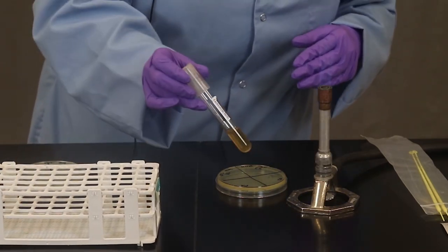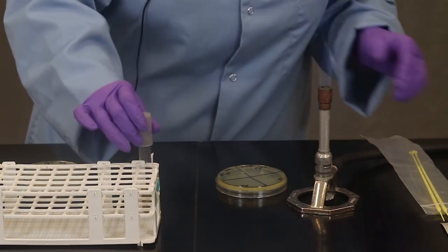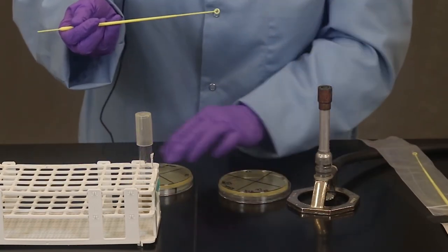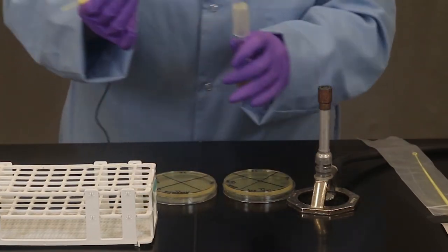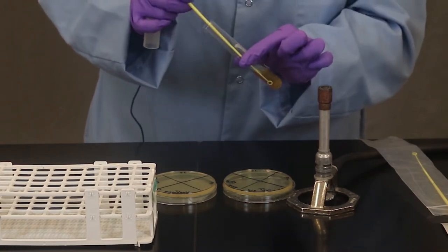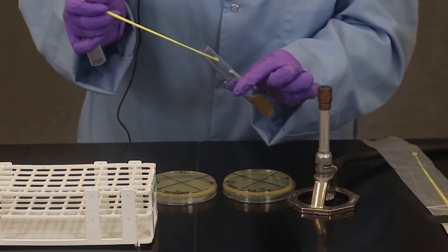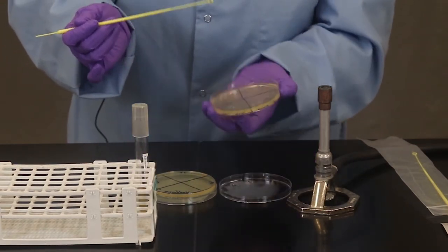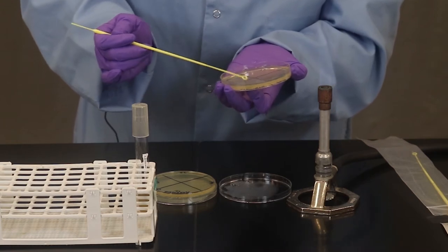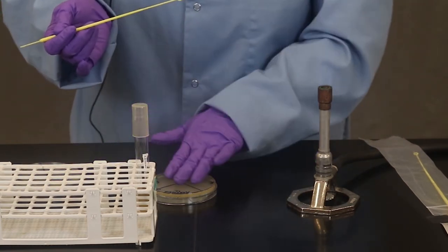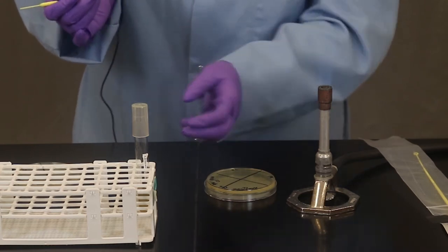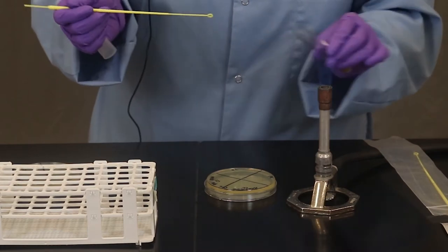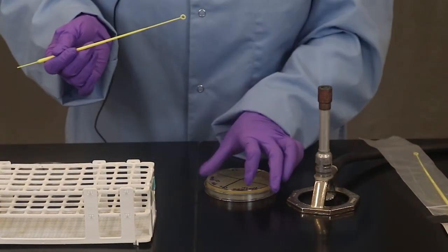The next one up is Lactococcus lactis. Now you do want to be careful. If you're adding a lot of liquid to the plate and you're tipping the plate there's a possibility of it dripping. You can cross contaminate your samples into the other quadrants. So you just want to be careful and pay attention.